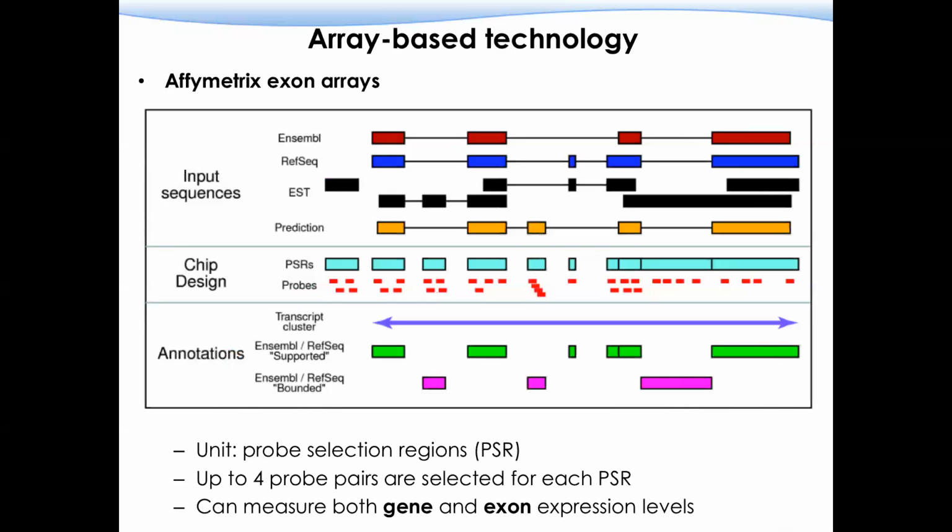So for this one, Affymetrix initially put out this product. I mean, there was no sequencing. So they say, okay, you can address the splicing basically by profiling each individual exon individually, and we don't recommend you to compare different exons. Rather, we recommend you to compare one exon across different conditions. So you don't say that the first exon is expressed not as much as the second exon, the signal is lower, so that your conclusion is that the first exon is lower than the second one.